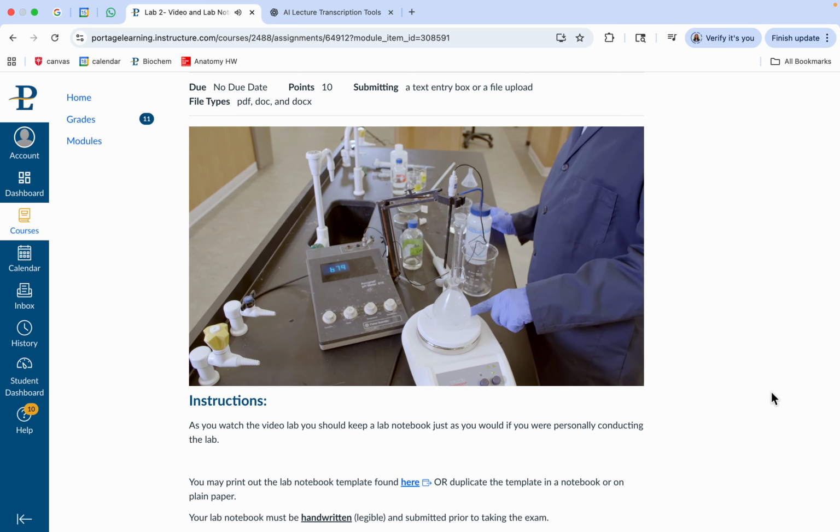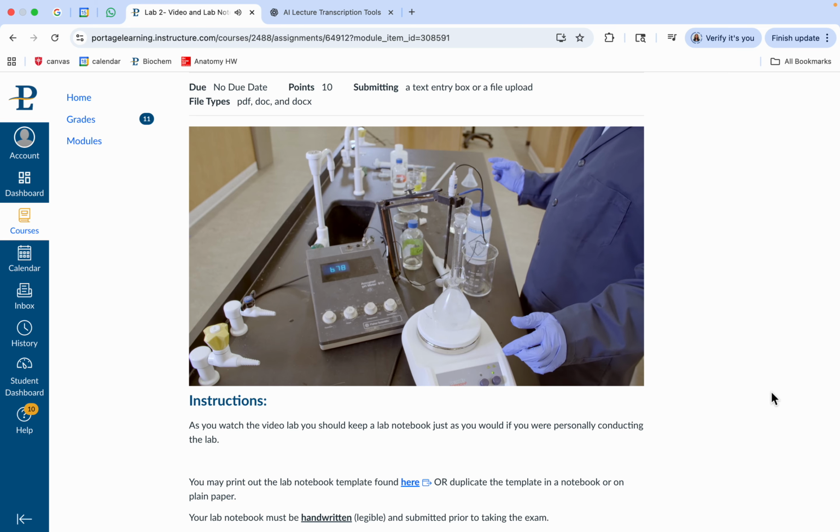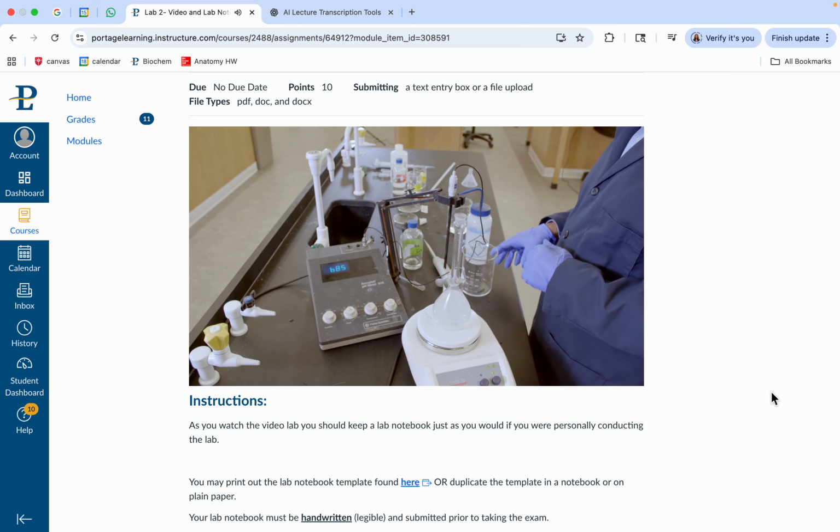Also, adding the water here will give us a little bit more water volume and make it a little bit easier for some of these salts, the sodium phosphate, dibasic, and monobasic, to dissolve. And so they're actually dissolving fairly well. So we're going to allow those to dissolve.